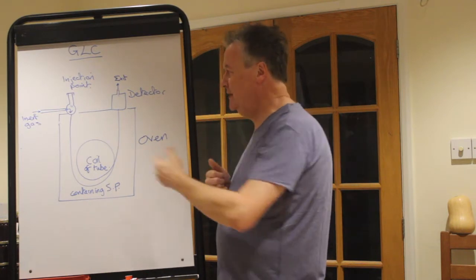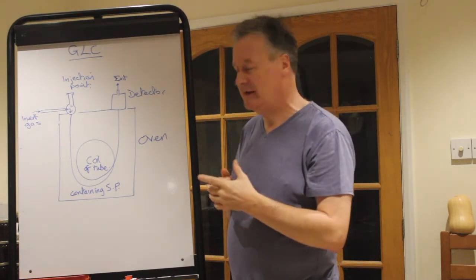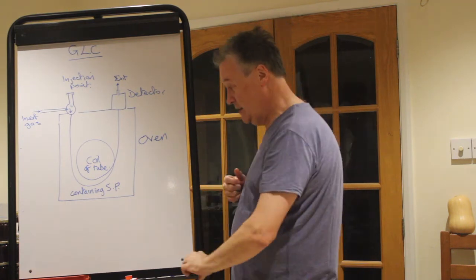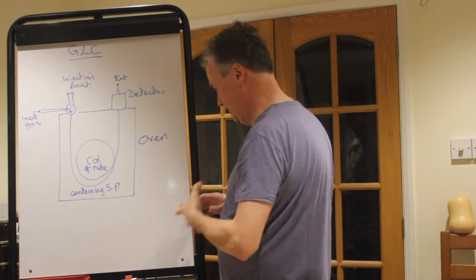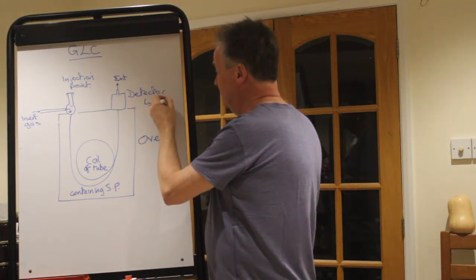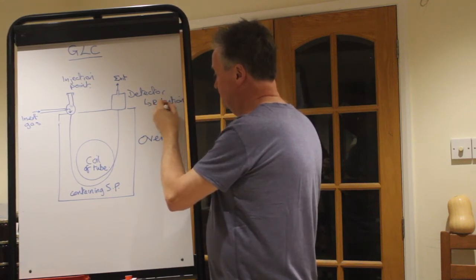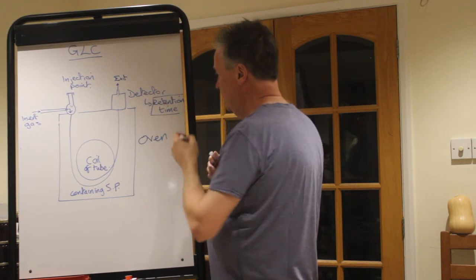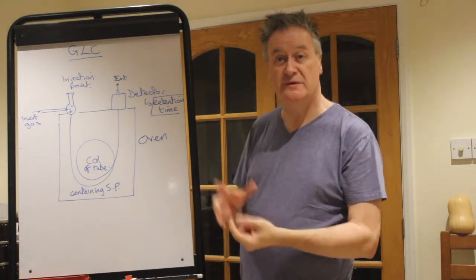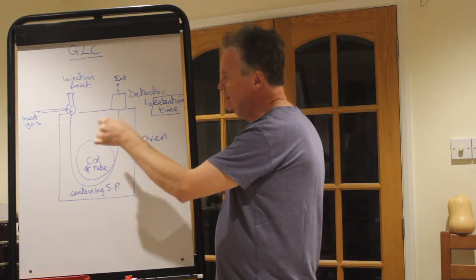And it gives rise to, as it goes through, something that interacts well with the carrier gas or the inert gas, gets through quickly, and it has a short retention time. So we are talking the word retention time, which is what the detector gives you. So the output is a series of retention times, and we'll look at what the output looks like after the edit when we do it, but I shouldn't be finished with this.